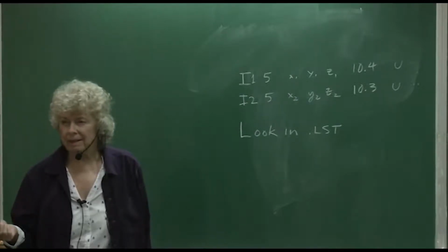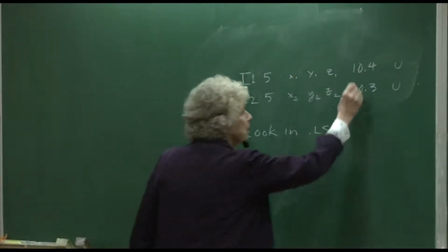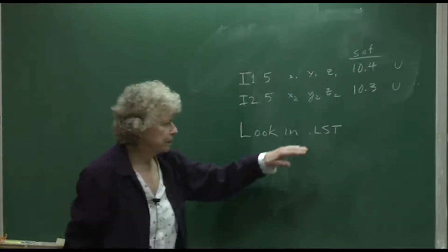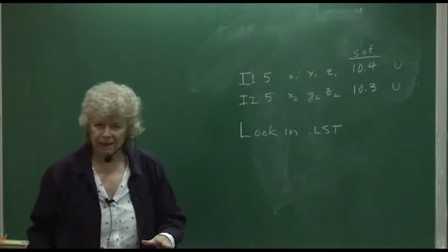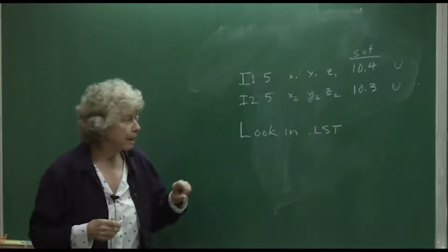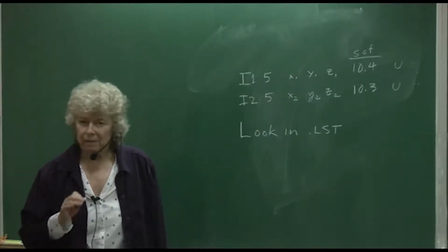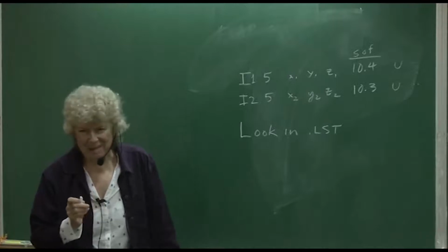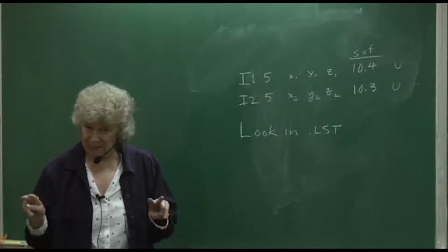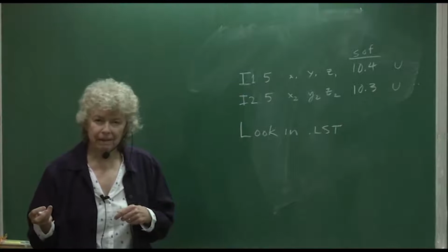Have you noticed that? In the LST file, the second set of positional parameters gives you all of these occupancies. So that gives you the final occupancies of everything. So take those occupancies and the atom types that they belong to and multiply by the number of general positions. That's a fail-proof way to get the number of atoms of each type in the unit cell. Okay, now you know how many are in the unit cell.